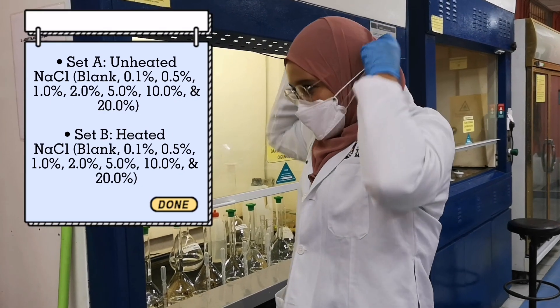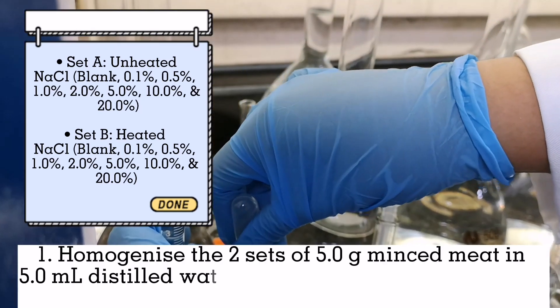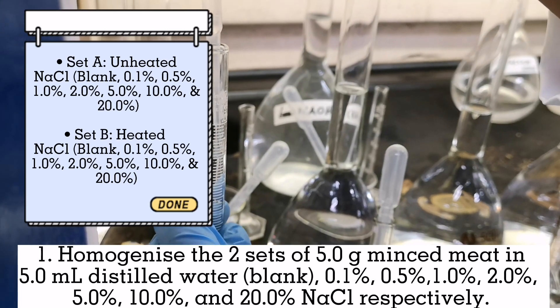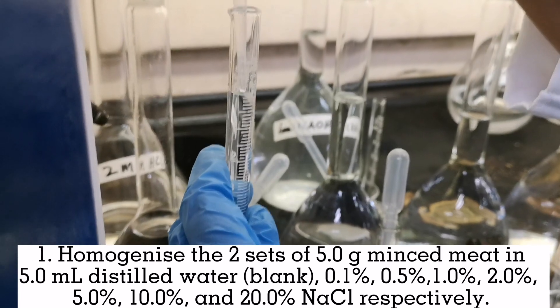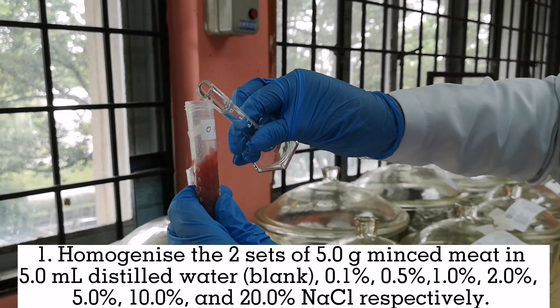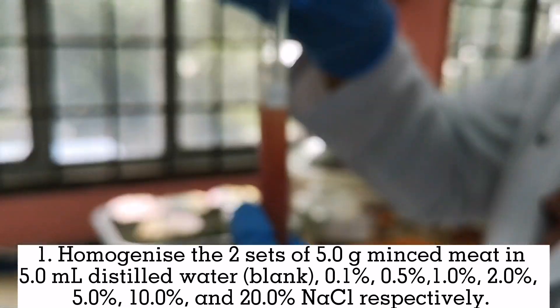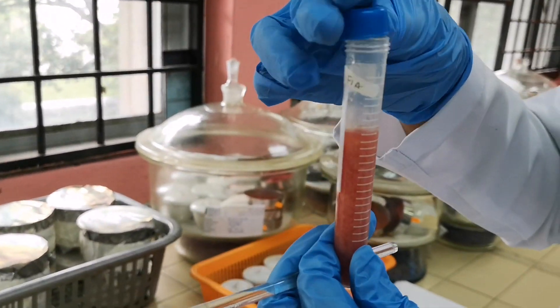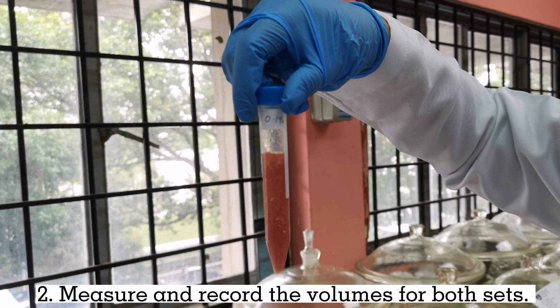For the second experiment, homogenize two sets of 5g of meat in 5ml distilled water, which is blank, 0.1%, 0.5%, 1.0%, 2.0%, 5.0%, 10%, and 20% of sodium chloride respectively. Next, measure and record the volume for both sets.